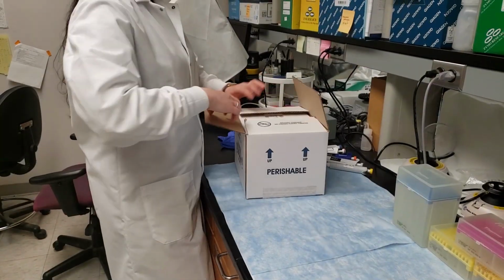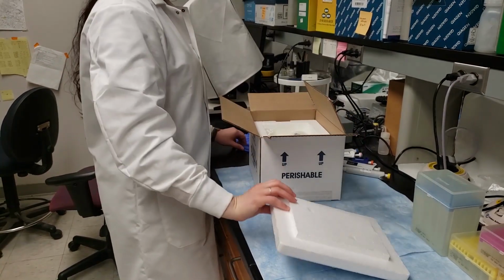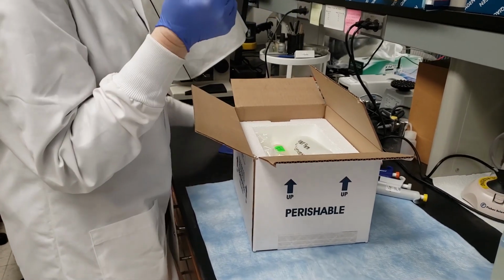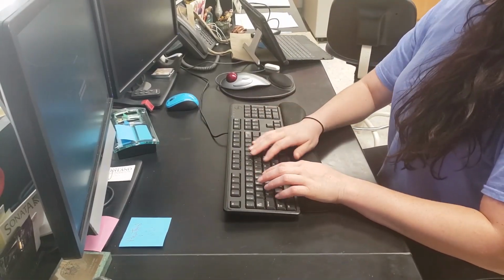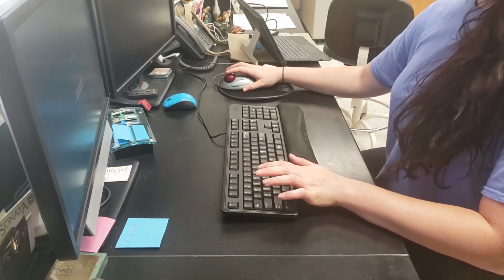At this time, the Food and Drug Administration has not made its final ruling on water sampling. This video shows a universal sampling technique. Handling and time sensitivity in compliance with the Produce Safety Rule of FSMA will be updated in the near future. Be sure to check with your local lab to know when they will need to receive your sample.